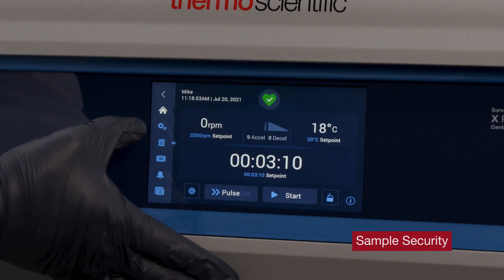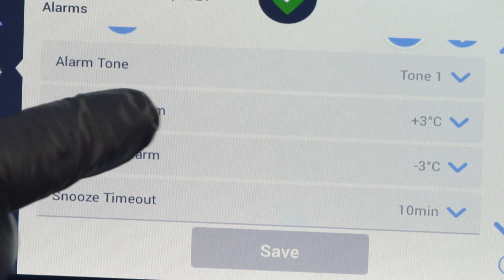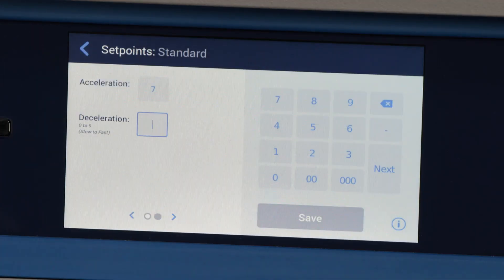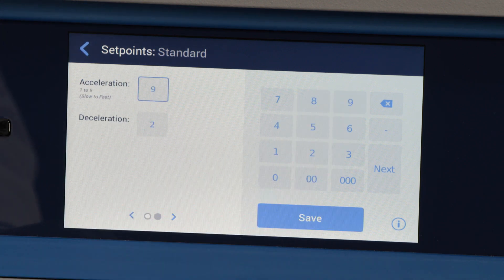The X-Pro centrifuge also offers functions to protect your sample during runs. The high and low temperature alarm functions verify environment stability. The microprocessor controlled acceleration and deceleration minimize sample disruption, especially for speed set points under 500 times G. These functions bring an extra layer of security for your samples.